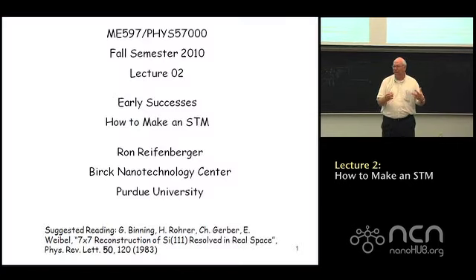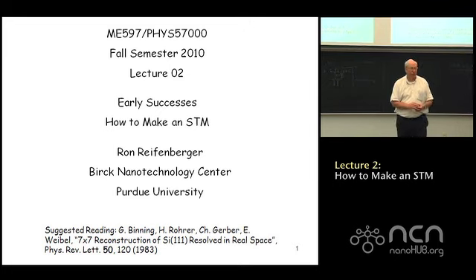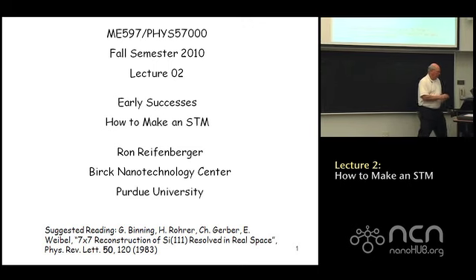nanohub.org. Okay, so in the second lecture, we're going to talk about how to achieve a scanning tunneling microscope, how to actually build one. What are the considerations that you need in order to make such a microscope work?